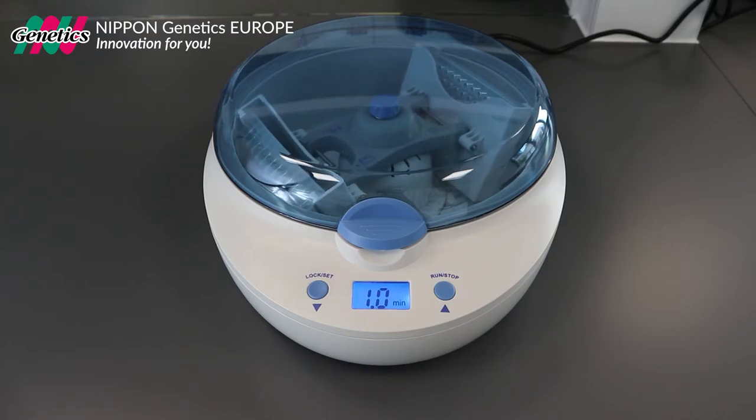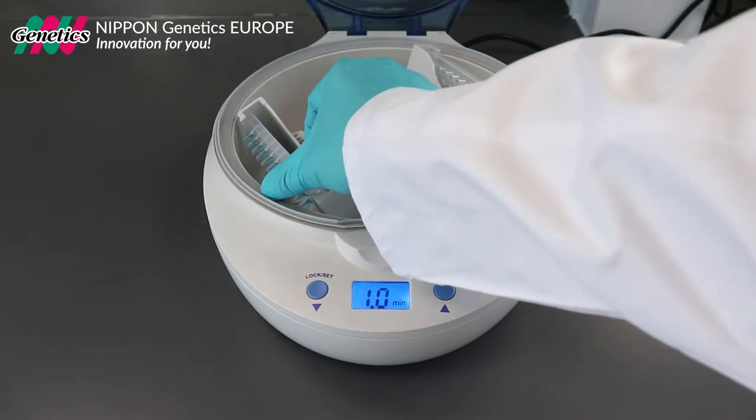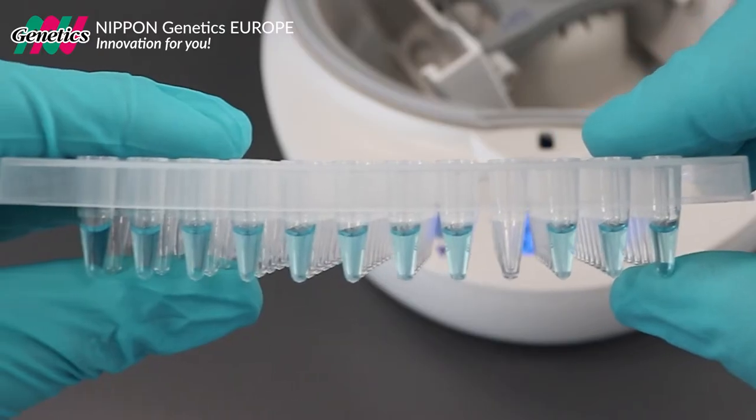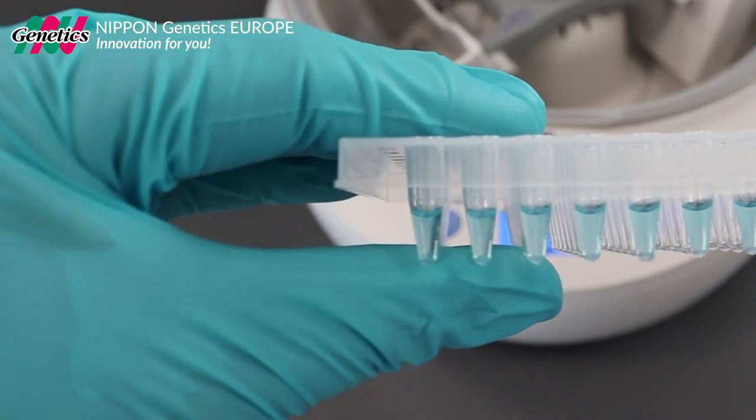After the run is finished, the centrifuge will give a signal and the lid will open automatically. Remove your plate from the plate carrier. The liquid in the plate is now nicely positioned at the bottom of each plate well.